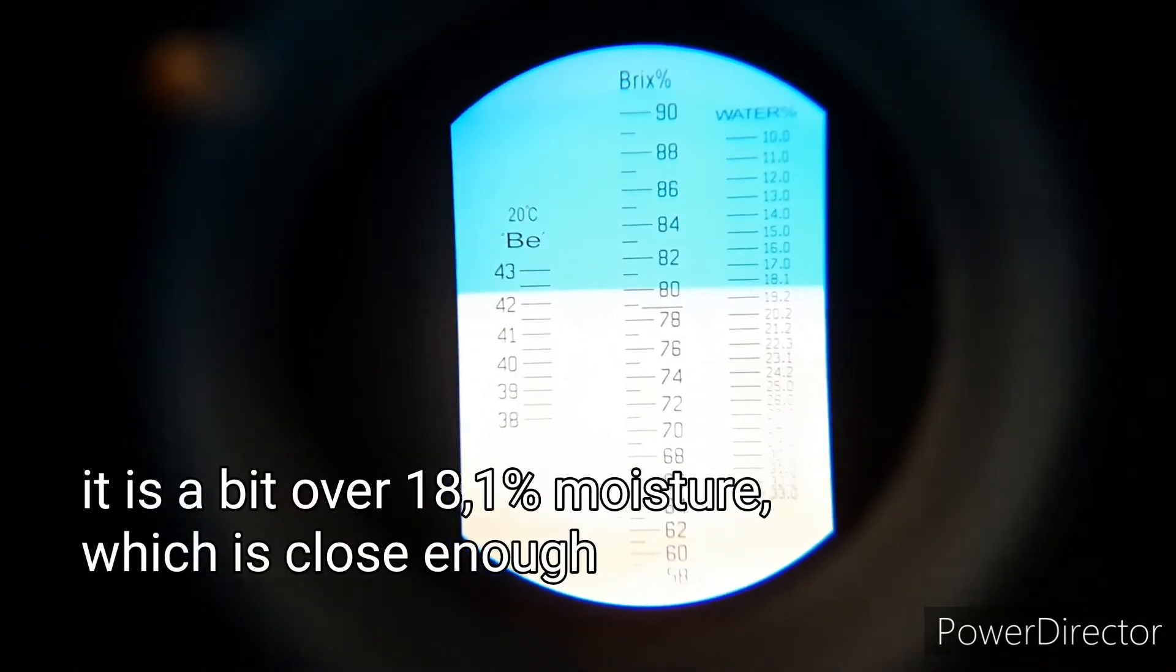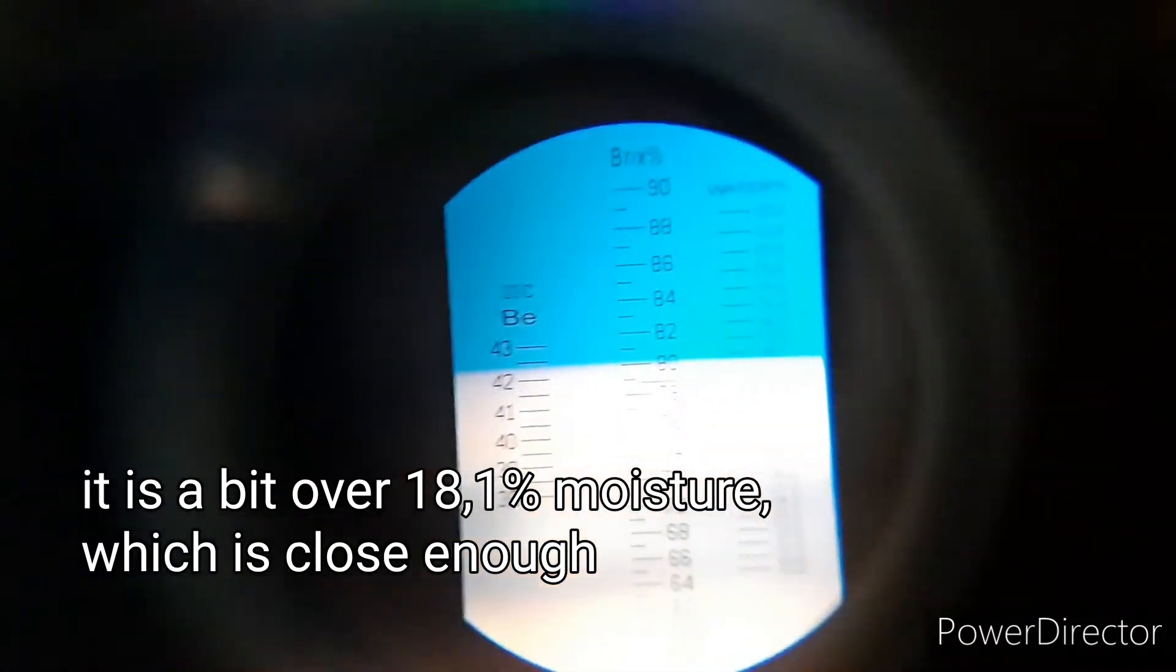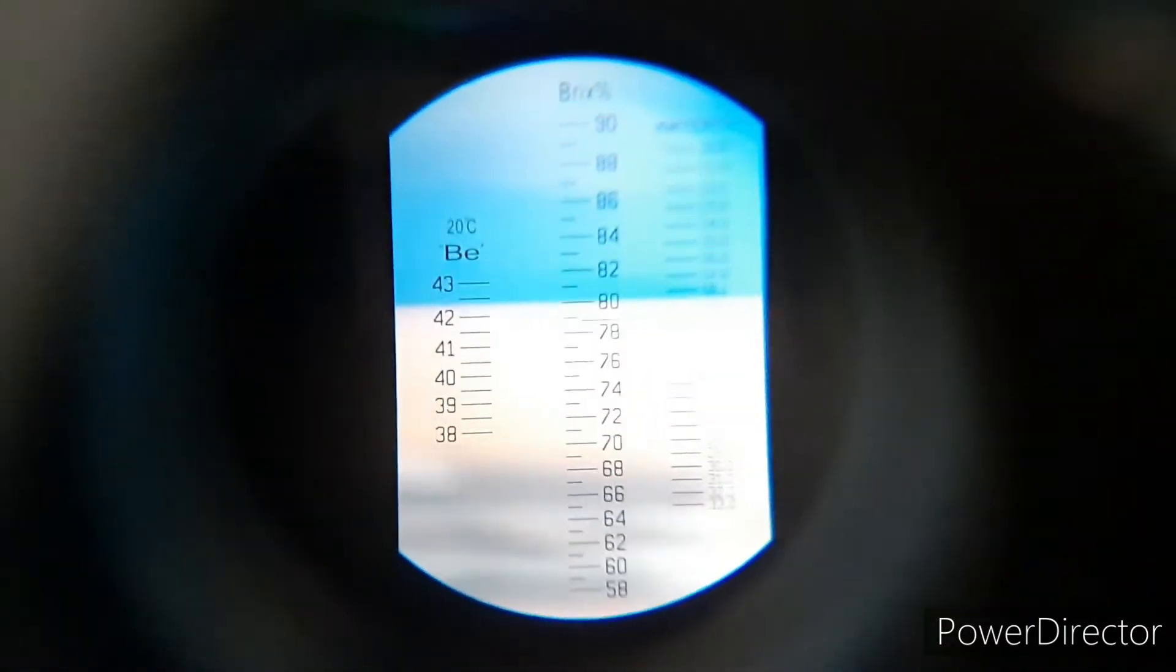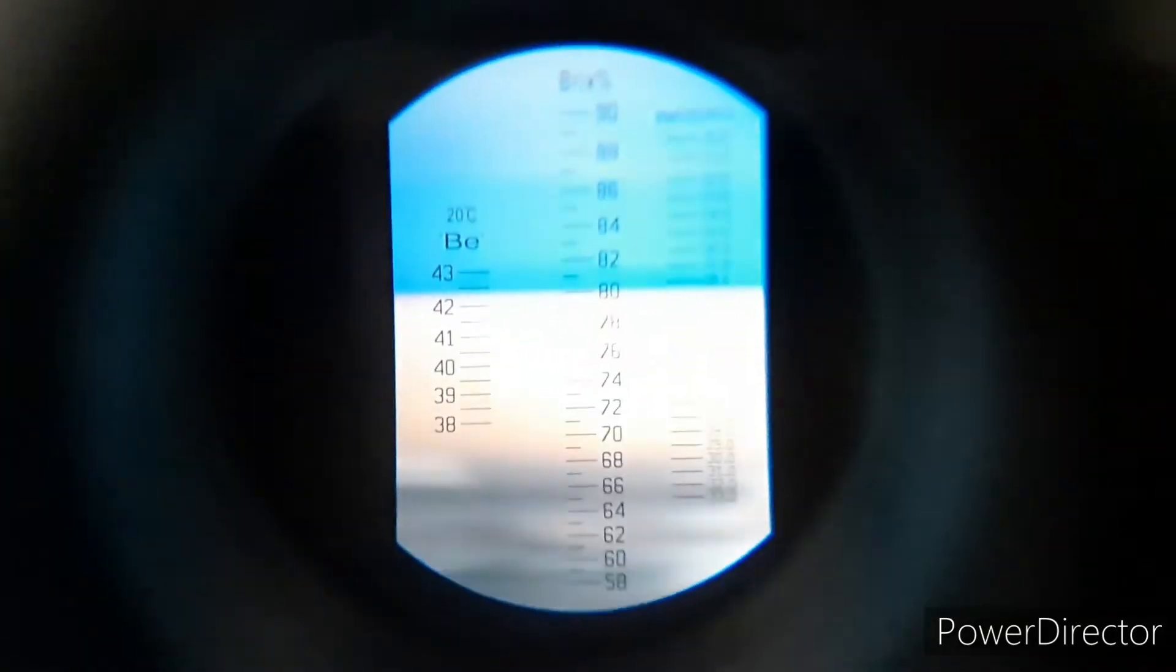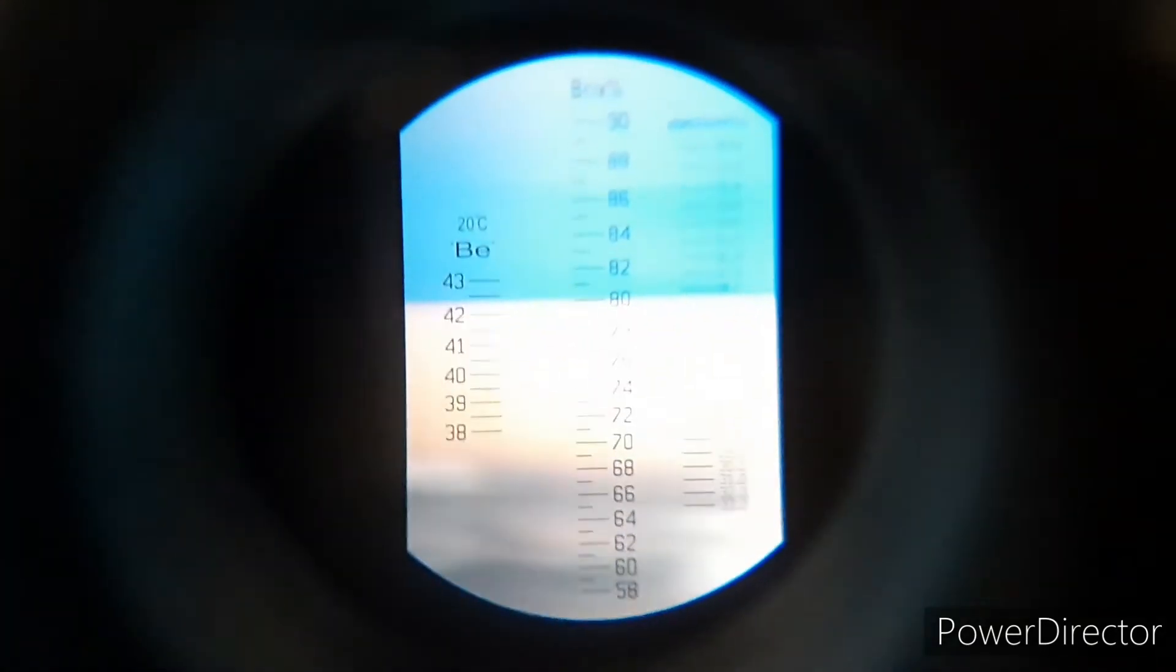There it is, now it's calibrated the correct way. You can test your honey so you know the moisture content. Honey needs to be under 20 percent, except for heather honey that can be a bit higher.